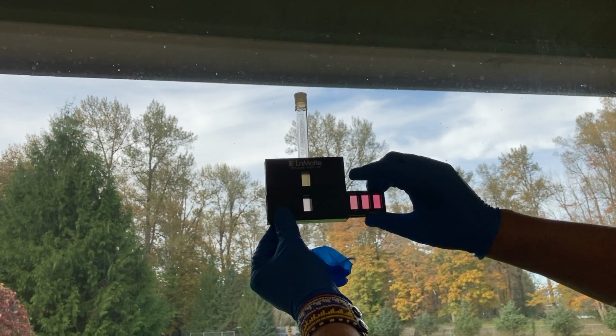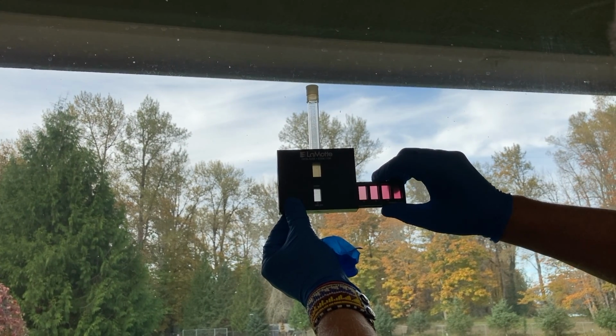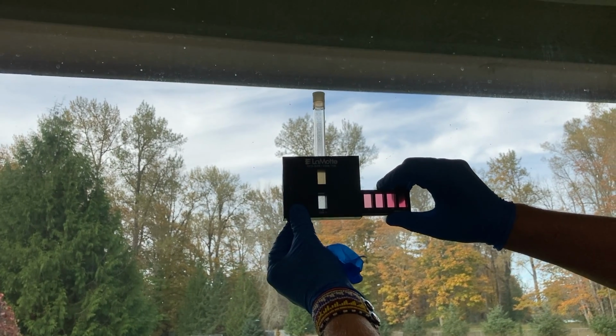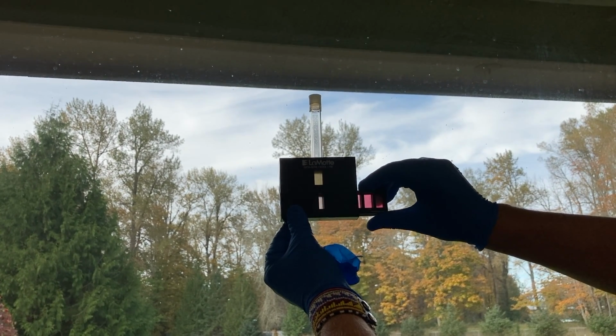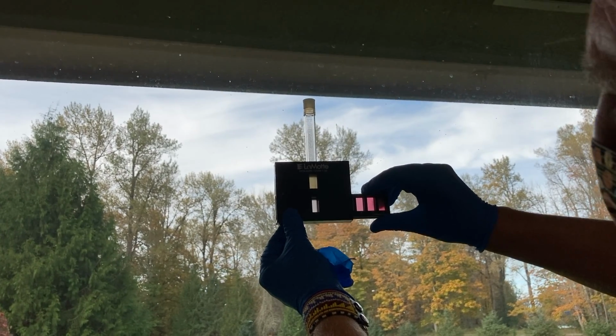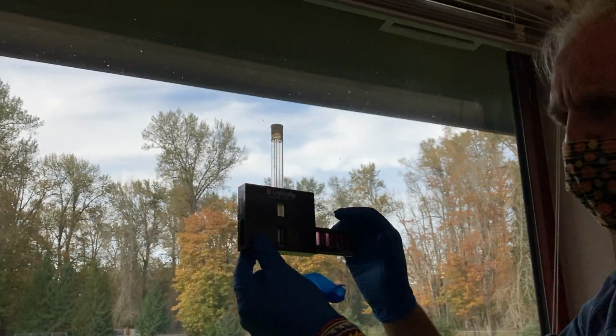It's definitely not pink. It's not clear either like that. So that's 0. And I'm going to say that's what we're going to go with. Yep, we're just going to do 0.